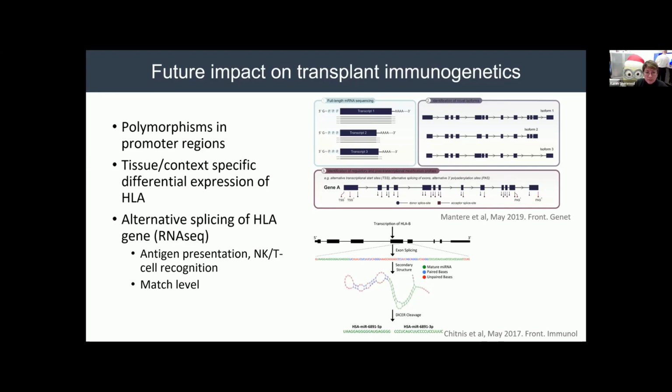So having transcript-guided long-read sequencing and expression assays, as these become more accessible, we can integrate information from isoforms and expression data into donor selection, DSA risk stratification, and other tolerance strategies. These are coming, but right now are unrealized opportunities that we could move forward in the space of transplantation.